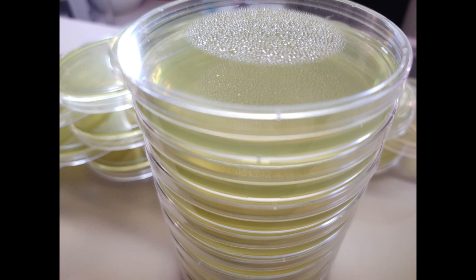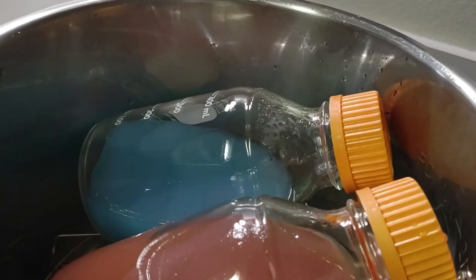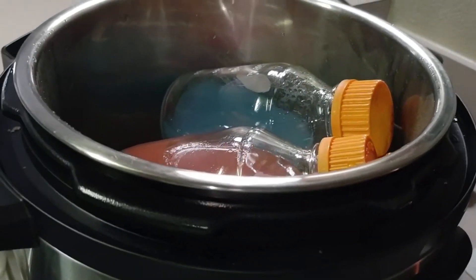As a reminder, if you have any condensation, just flip your petri dishes or your jars upside down. We recently had a comment asking about the temperature of your agar before you pour it, and we have found that between 120 to 140 degrees is just the perfect cooling temperature to start pouring.